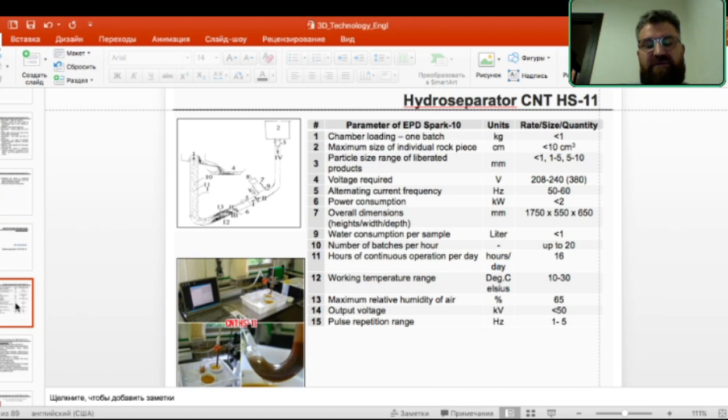First of all, it's representative, so you don't need to process more than 100 kilograms, because 1 kilogram, if it's representative for the ore, would always produce the same mineralogy. So 1 kilogram is the optimum weight, though we are led by the grades of desired elements within that mineralogy that we're looking for. If we are talking about less than 1 ppm down to say 0.5 ppm, 1 kilogram of the sample is still enough. But if it's ppb quantities, milligrams per ton, it can be up to 3 kilograms of sample.